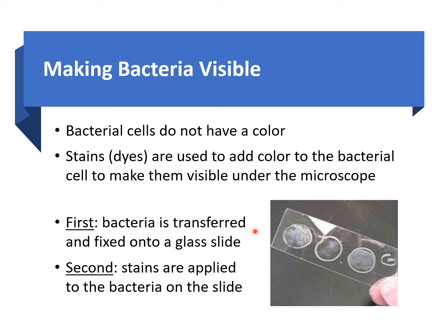So the first step is you would want to transfer some bacteria onto a glass slide. So you would have a slide right here. Now, we usually add just one sample of bacteria, but sometimes you can actually add several samples all on the same slide.